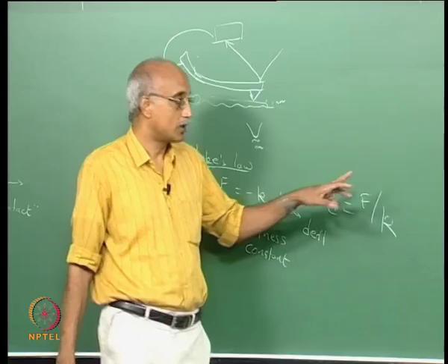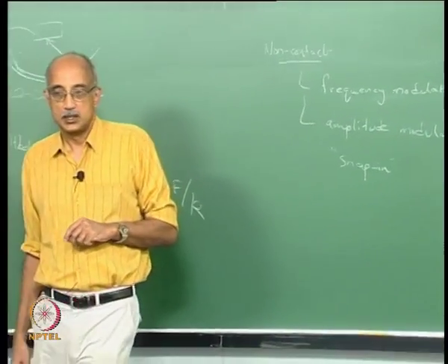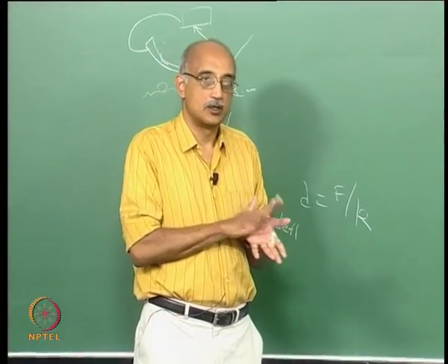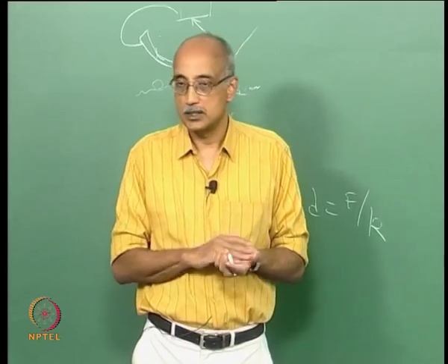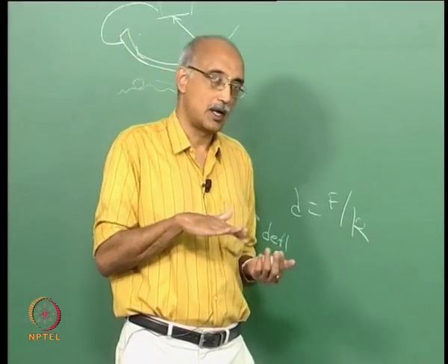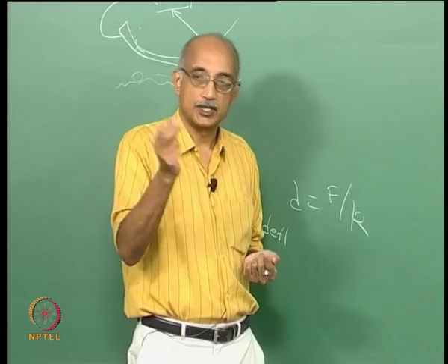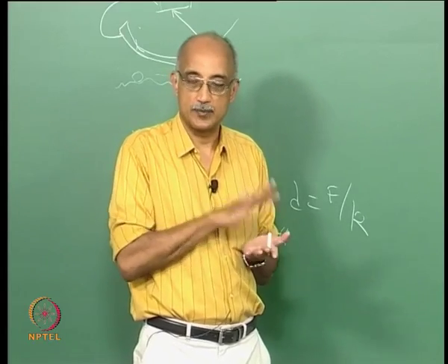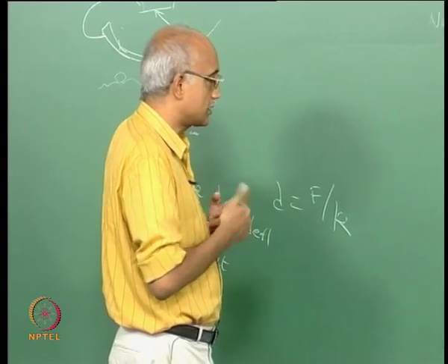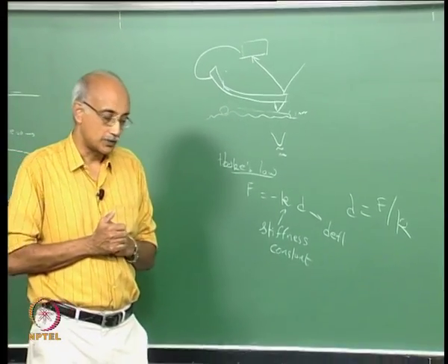The main problem in the non-contact mode is, because you are using low stiffness cantilevers, there is no way that you can pull the probe tip back once it has locked into the surface. Whereas in the intermittent or tapping contact mode, the stiffness values are high enough that you do have the ability to pull the tip back even after it has made contact with the surface. So these are the different modes of operation of an atomic force microscope.